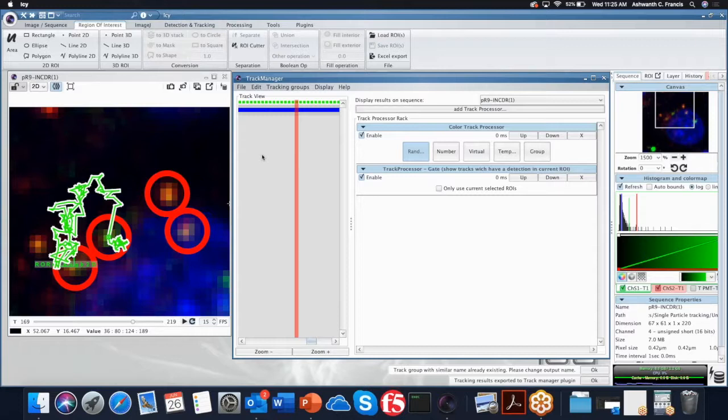Okay, so there is manual interpretation, right? You first track the objects using the software, then you follow whether the tracking is good. Mostly it will do a good job tracking the object. At some point, when your particle jumps too far away, in our case when we add the drug, it just jumped off somewhere else, right? Then you want to identify where that particle moves. So you see the same particle there and say, okay, that track and this track belong together. Then you can join these two tracks to get the full tracks, okay?